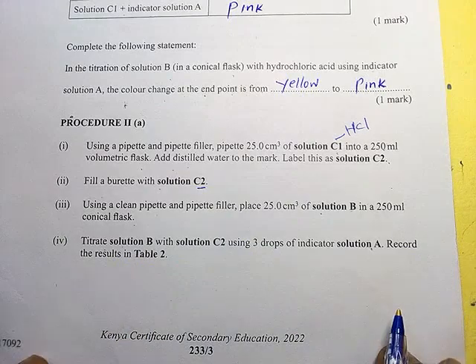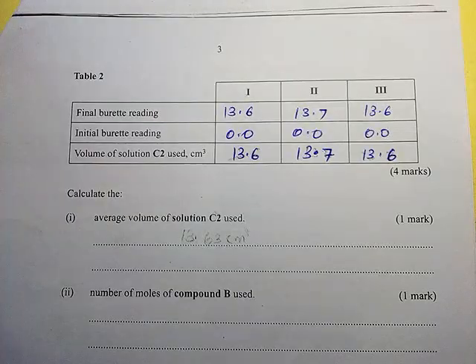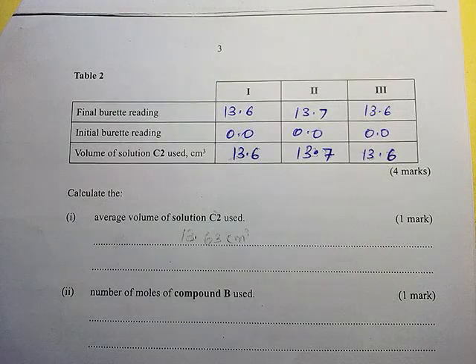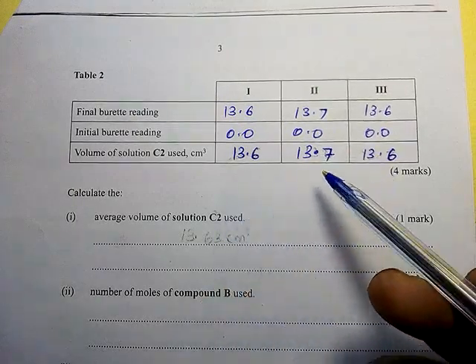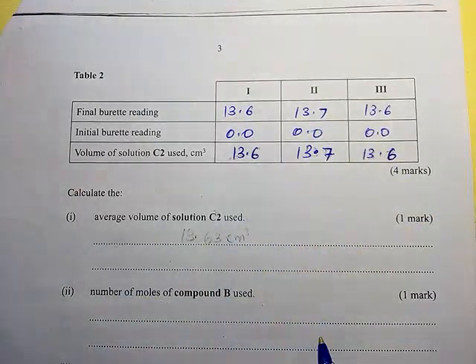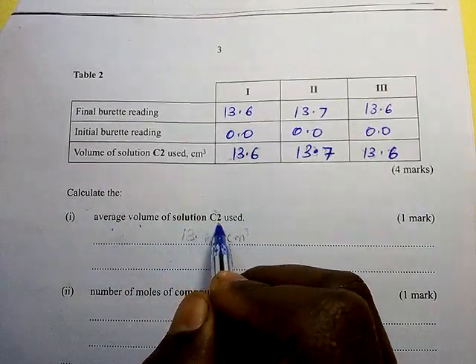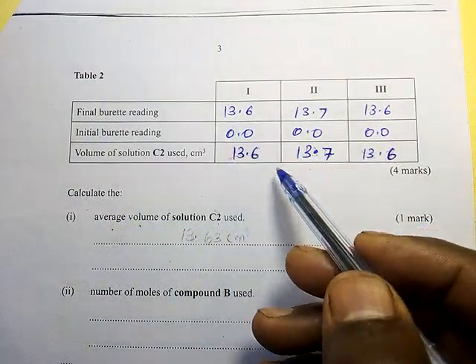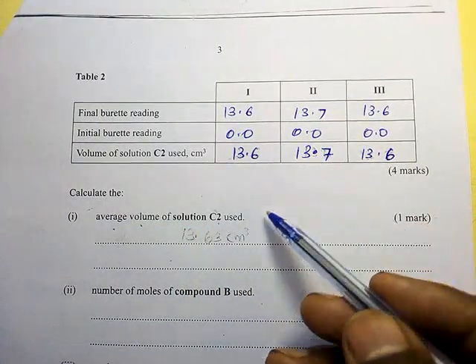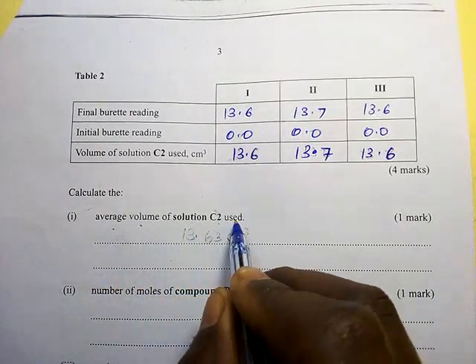So after doing that, these were the values. These were our values, because each school could have their own values, so don't worry about the value. This number doesn't matter. You can use your own and you will score the marks. Calculate the average volume of solution C2. So when you see this, it doesn't mean that if you got 14, it is wrong. If you got even 20 cm cube as an average, still it is fine.